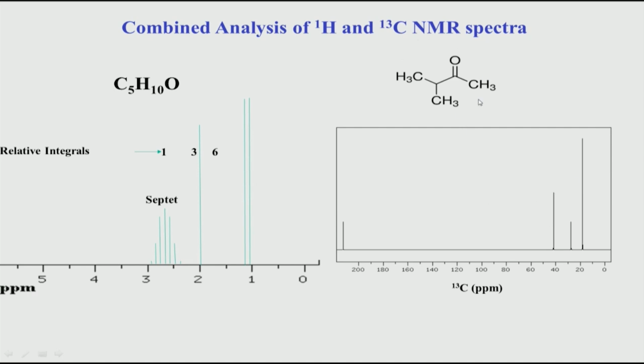So, this is the structure of the molecule which we saw earlier, and this is explaining the carbon spectrum, because the carbonyl is a ketone which comes very downfield shifted, and because this CH3 is isolated, it will be coming from here, and the one which is attached to CO, this CH, is slightly downfield shifted, which will come from here. But again, which carbon is which carbon, we are not sure from here. That connection between this proton spectrum and which carbon is part of the 2D experiment. We will do that later.